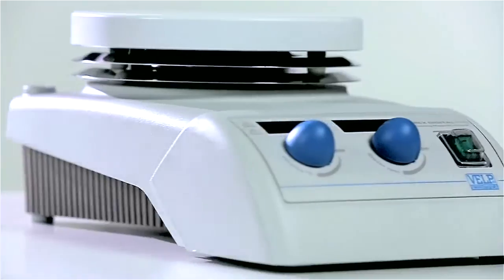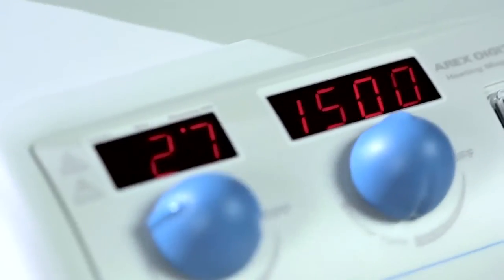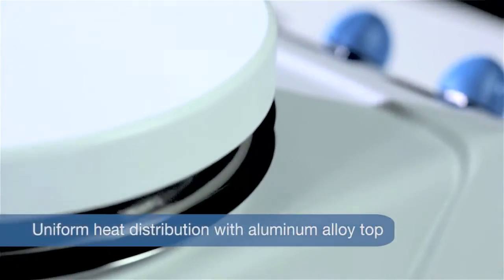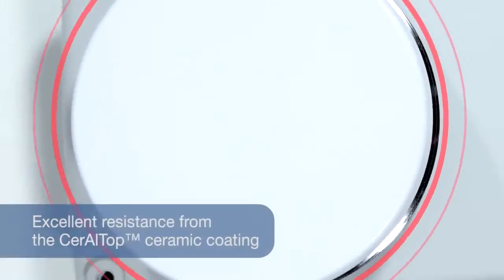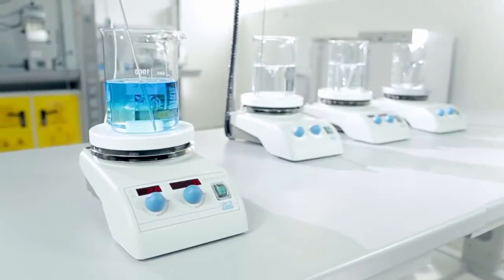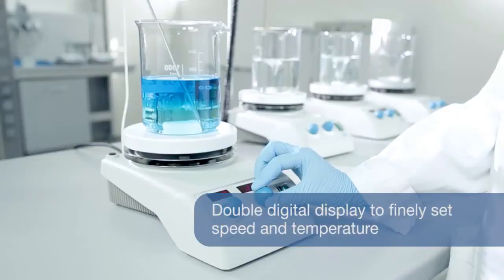The new AREX Digital Hot Plate Stirrer from VELP Scientifica is built for the very highest level of performance. It is incredibly powerful and remarkably resistant, with an aluminium alloy top protected by a ceramic coating. The CerAlTop Technology AREX Digital offers a completely different experience, with a double digital display to precisely set stirring speed and temperature.